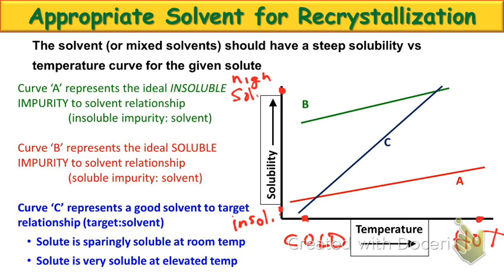Now the difference is at high temperatures. So I'd want to keep everything hot when I went through to filter and separate them. Okay, that's the trickier one to deal with.